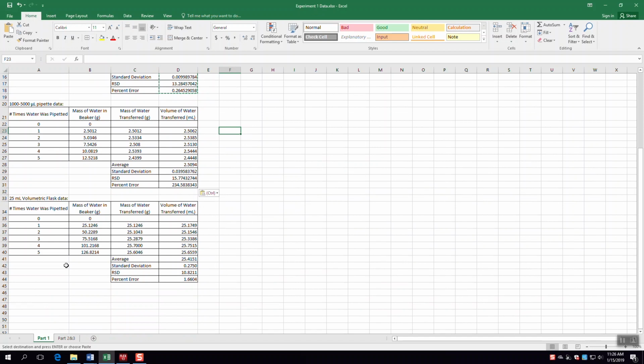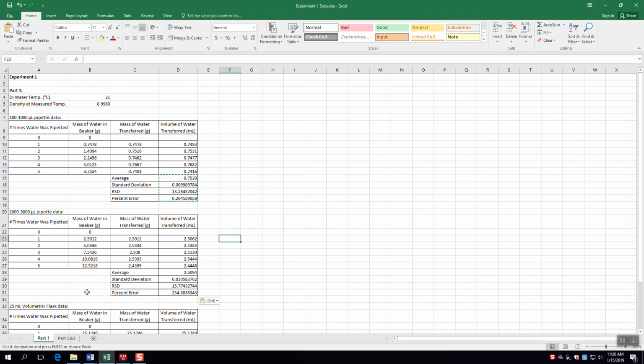So in order to do that, we need to reselect what we're subtracting from. We still want to have our 0.75 grams from this trial, but we're now subtracting back from the 0 point that we started at, which will fix the rest of our numbers moving forward so that we don't have that error carrying forward.